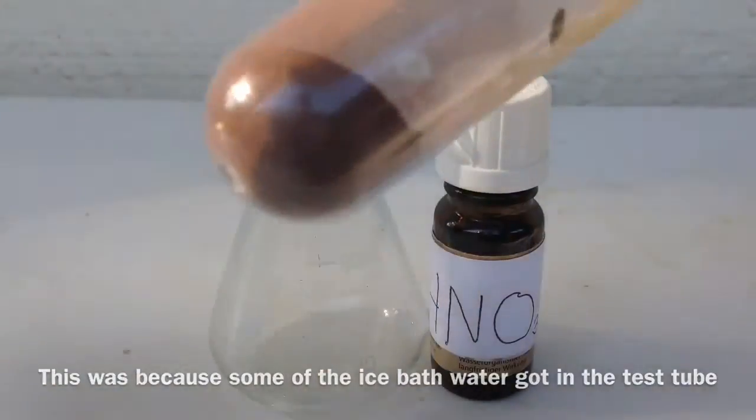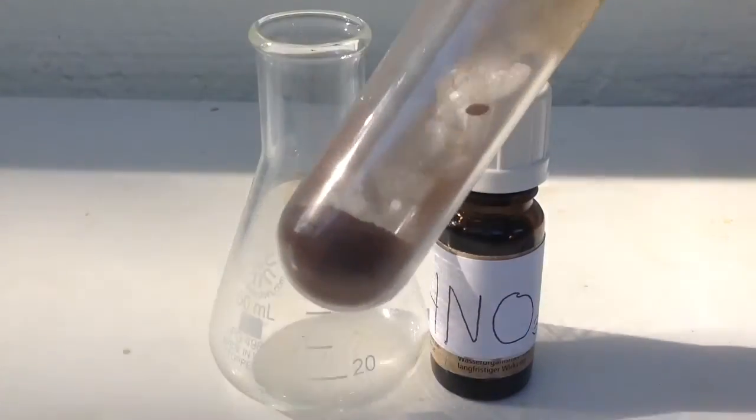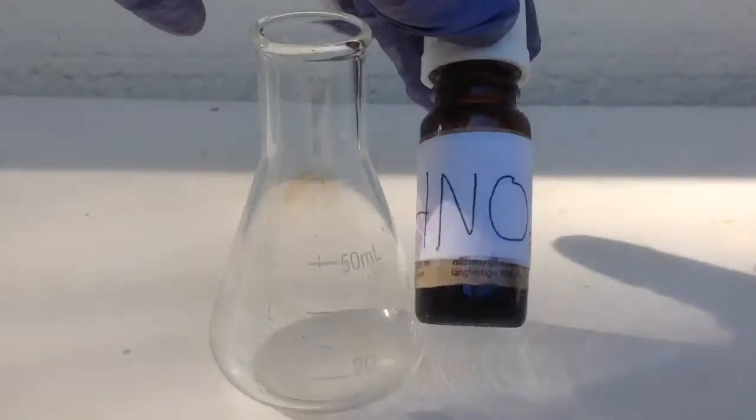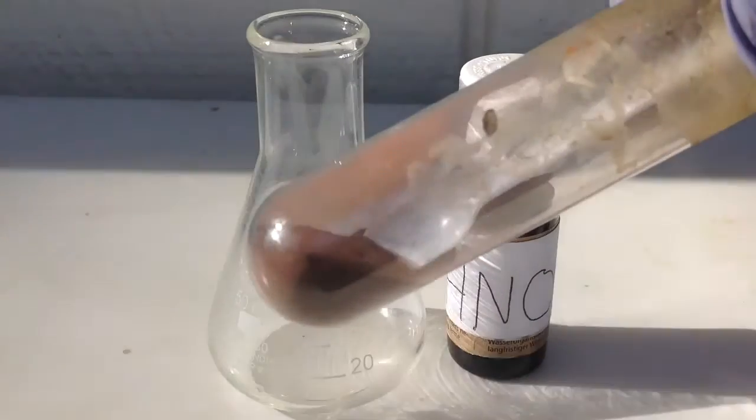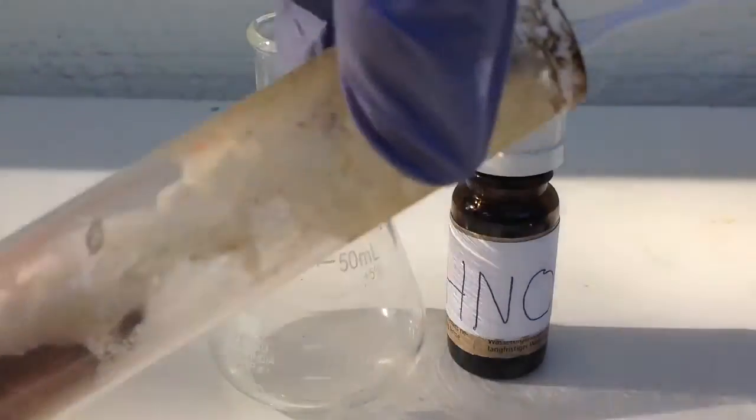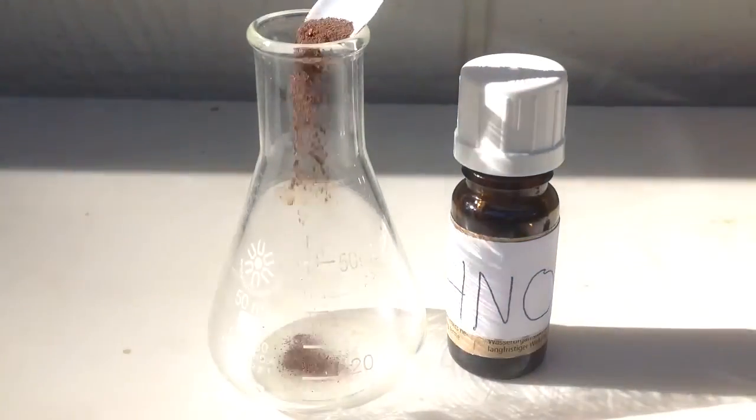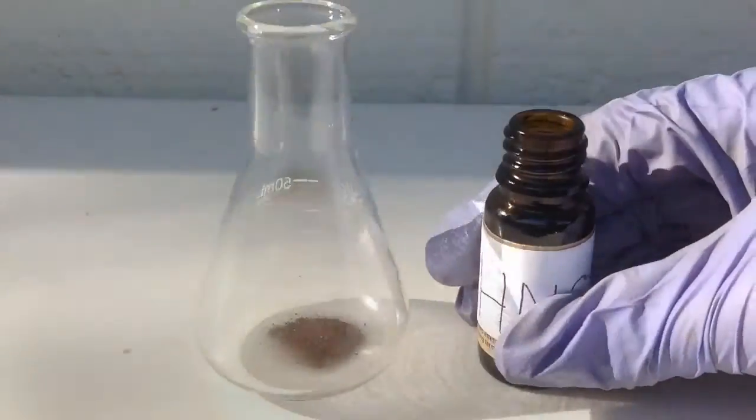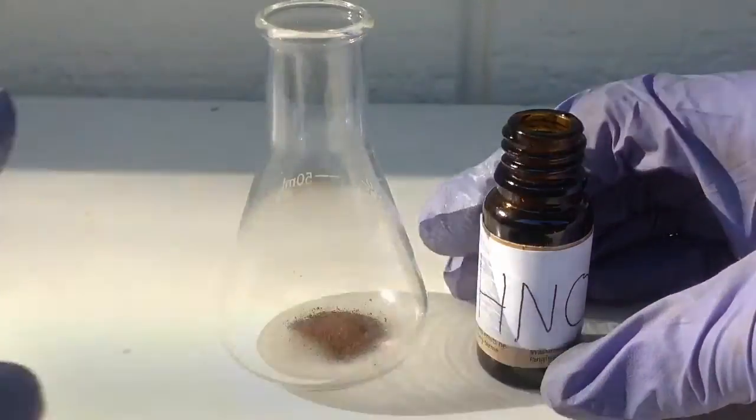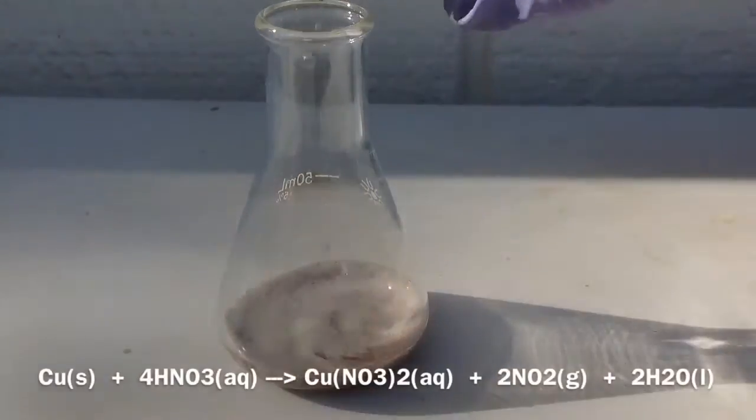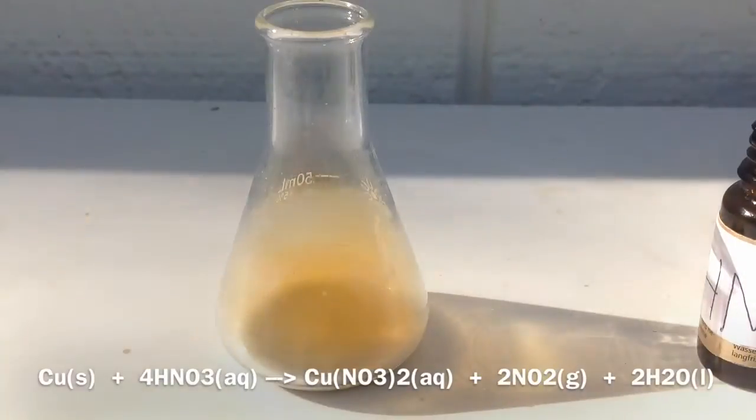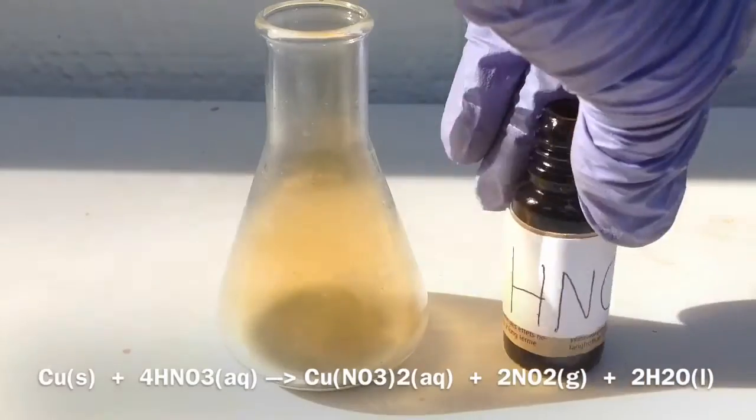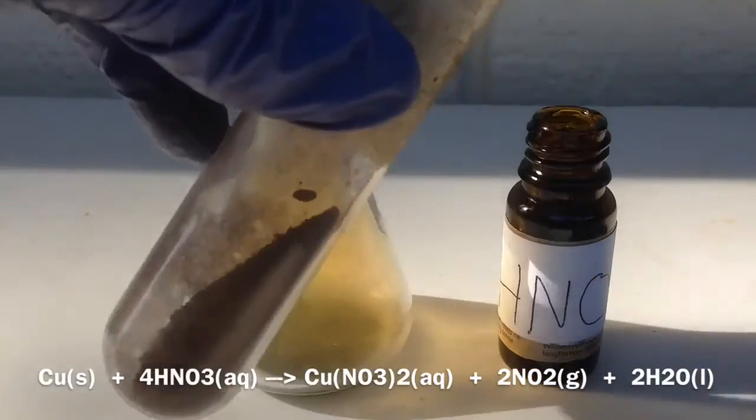Here we're going to test the reactivity of my nitric acid that I made with some copper powder. This isn't all of it, this is only like 15 milliliters of it. As you can see, the nitrogen dioxide gas evolved through the reaction of nitric acid and copper powder.